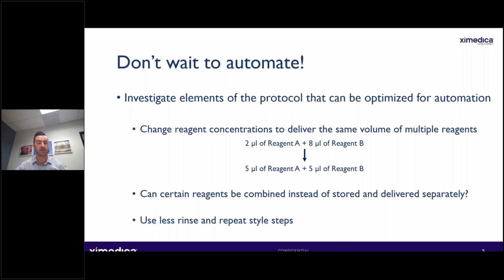So you might say, why does that matter? Well, firstly, you've removed a 2 microliter delivery and substituted it with a 5 microliter delivery. That can give quite significant improvements in CV with conventional automated fluid pipetting techniques. Secondly, you're now delivering the same volume of each reagent, so you can focus on optimizing for that 5 microliter delivery instead of delivering different volumes. Again, it might seem trivial, but if you're using maybe a non-contact dispense for the reagents, there's quite a bit of tuning sometimes in dialing in for specific volumes, and this can help a little bit.